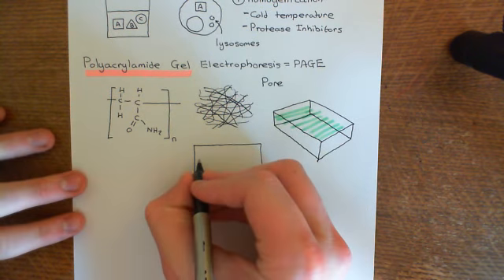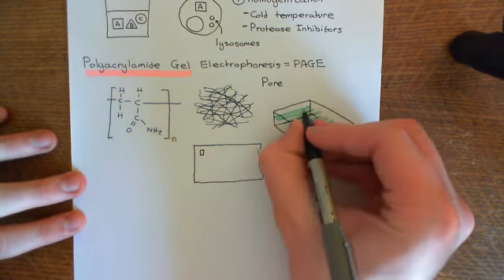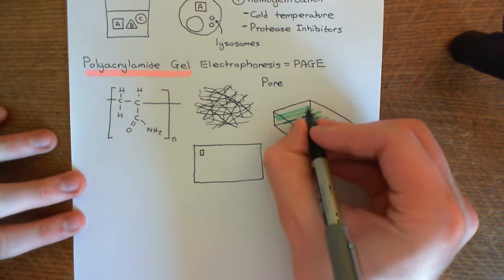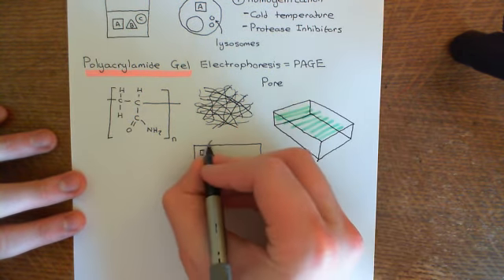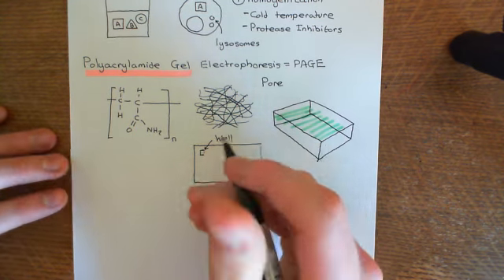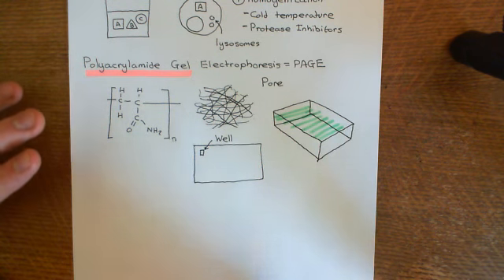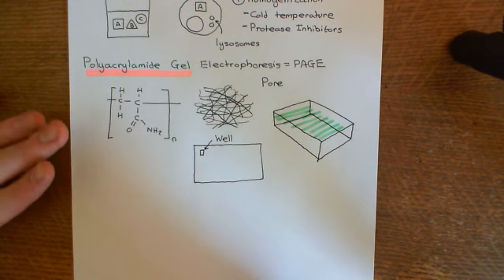We're now going to load our protein sample into the polyacrylamide gel, and basically what we'll do is create a little well. We'll just make an invagination of the polyacrylamide gel, cut a little bit out, this is known as a well, and we're going to put our protein mixture into here. Now before we put our protein mixture into this well, firstly we have to mix it with the loading buffer, and then we have to denature it.